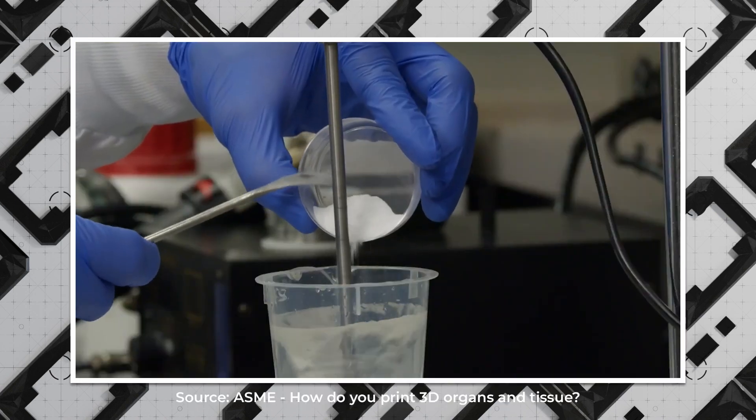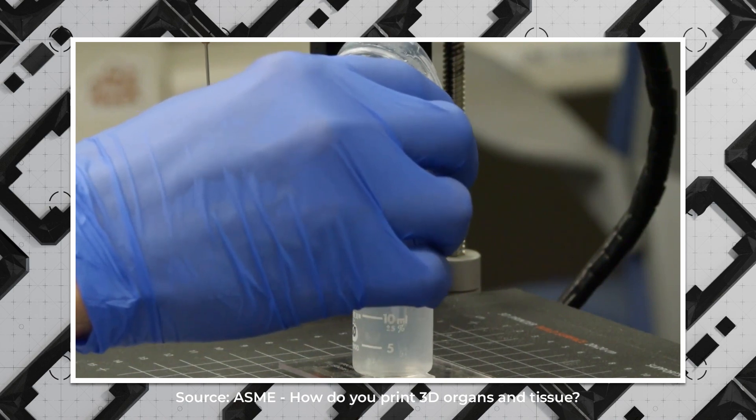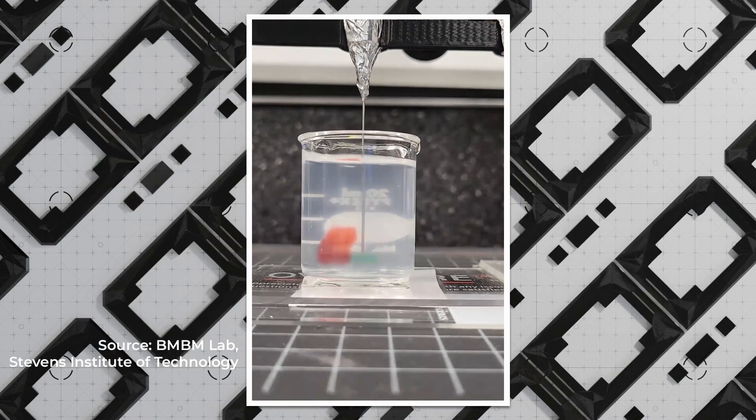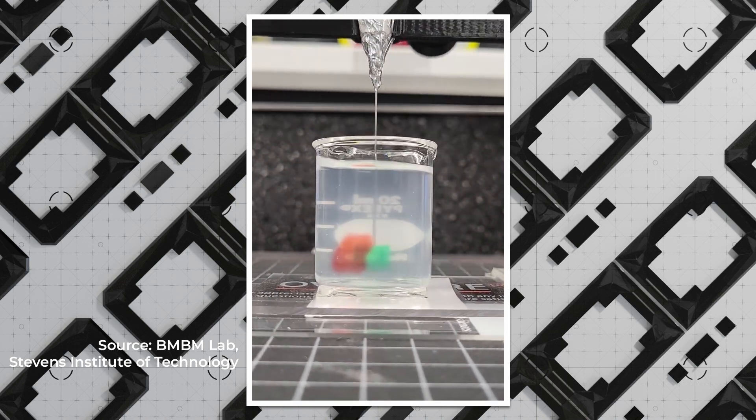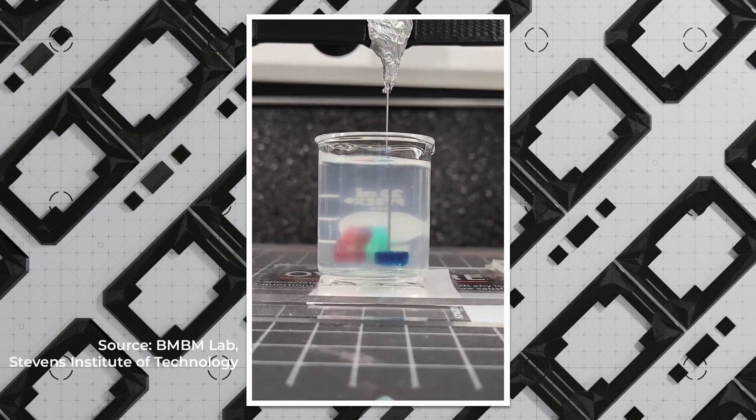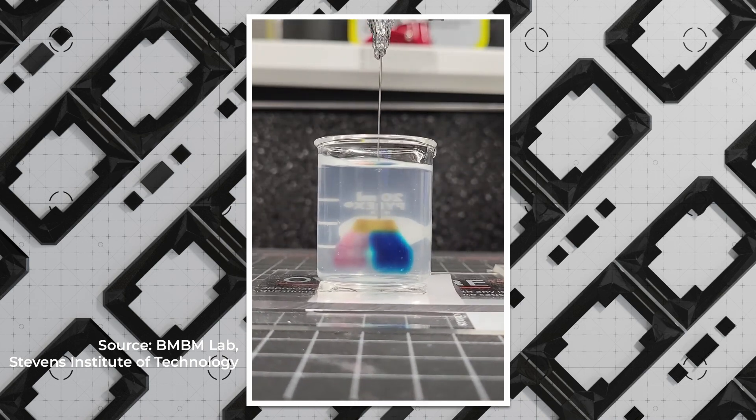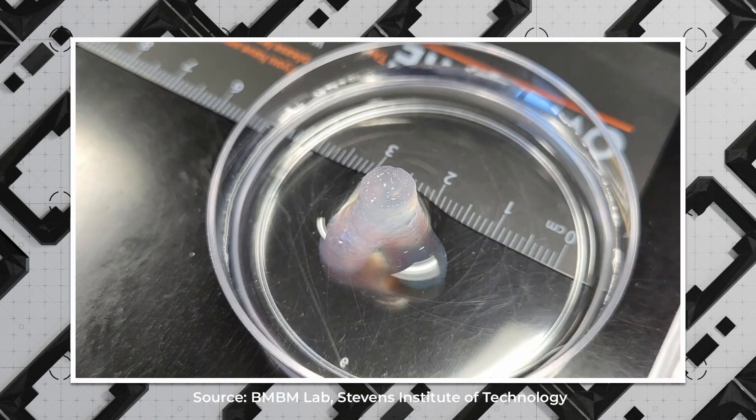Biomaterials - we're not only talking about biocompatible polymers or plastics. We're talking about hydrogels, soft gelatinous material, in which we can incorporate cells. You can print directly the structure with the cells inside, and the cells will grow in that environment, eventually become a tissue or an organ.